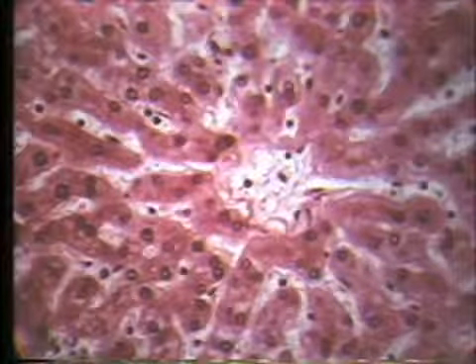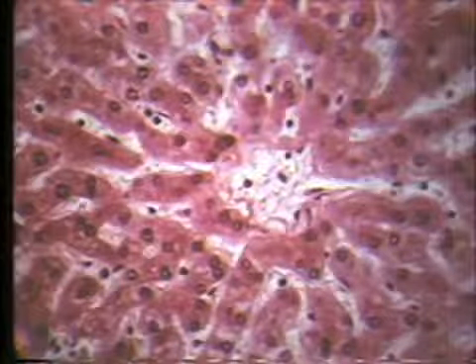Returning to the light microscope picture of the liver, we see the palisading and anastomosing cords of liver cells. We've chosen this cell to demonstrate at the light microscope level some of the inclusions that are found in the liver. The liver is a very heterogeneous type of cell, able to store and manufacture carbohydrates, lipids, and protein.